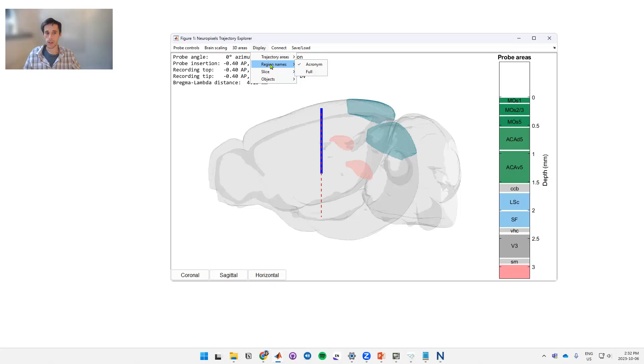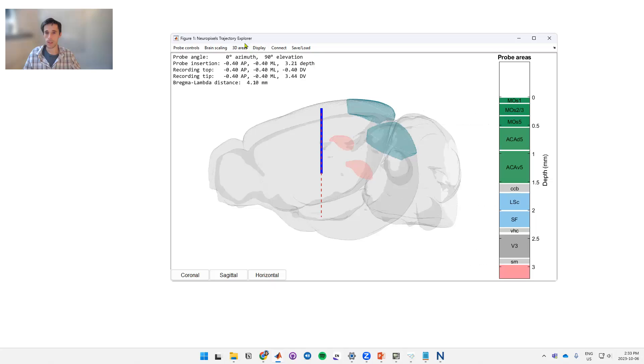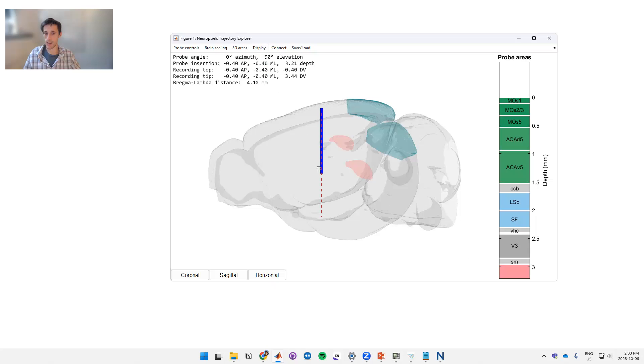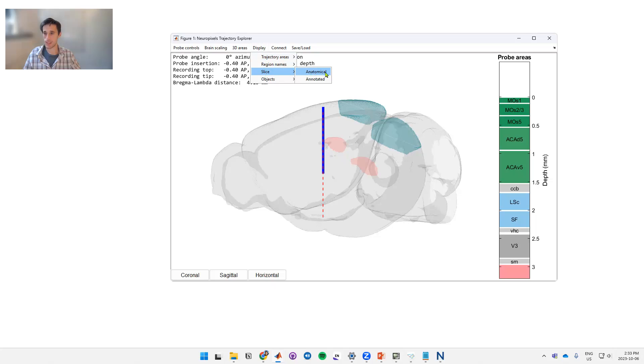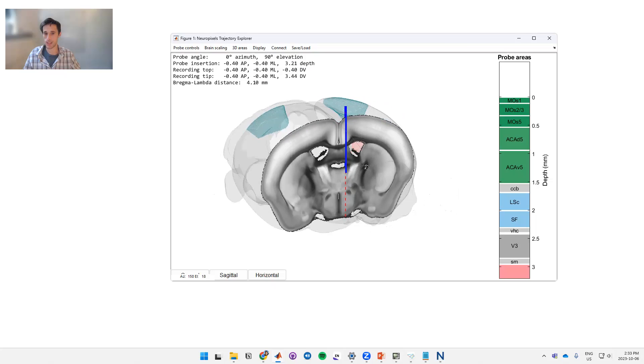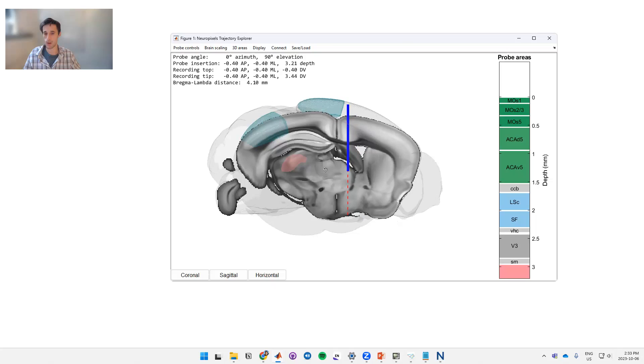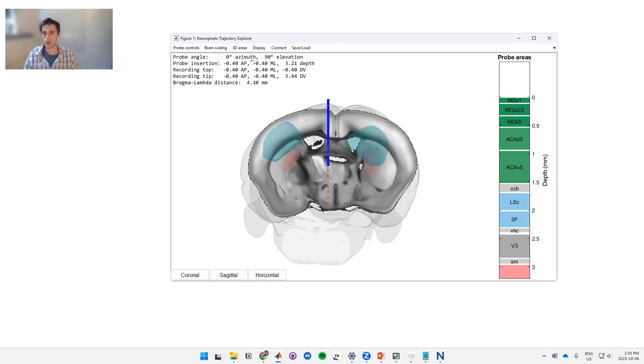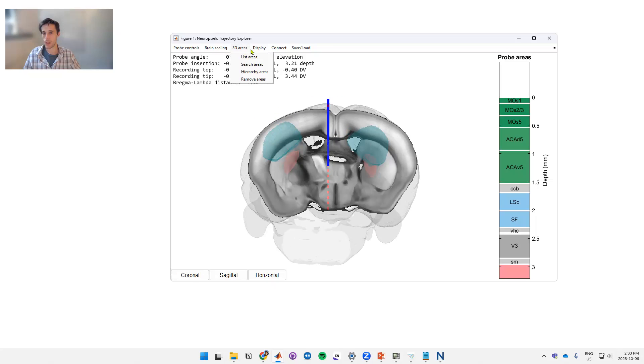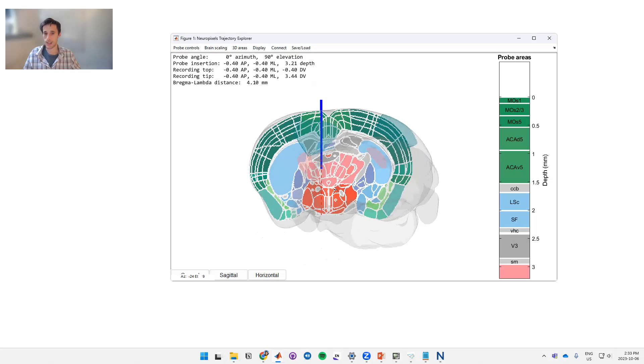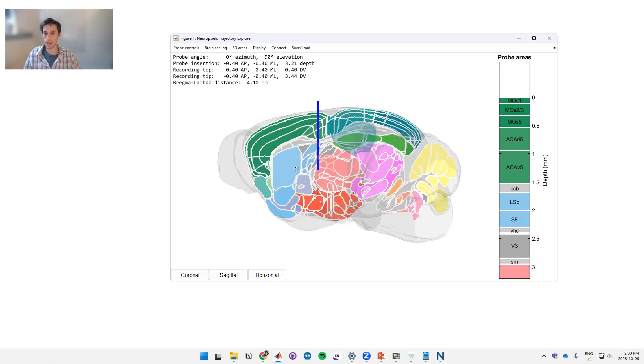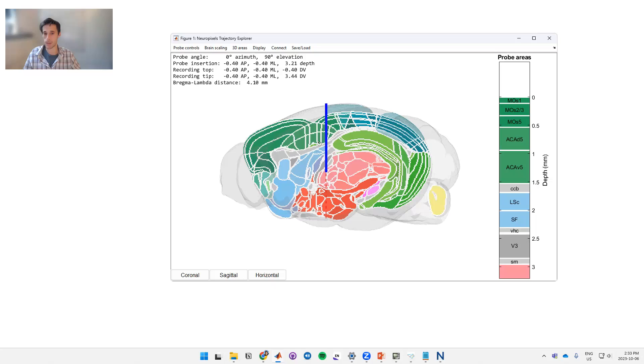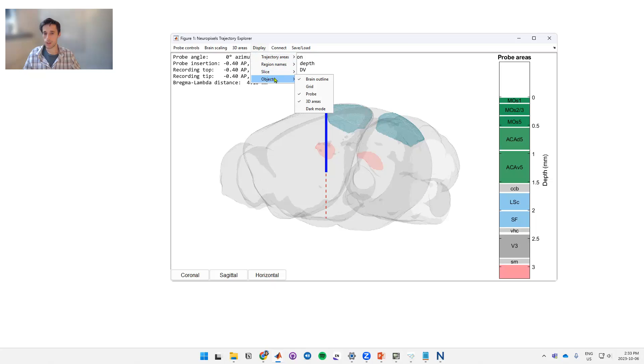We can also change the region names, so at the moment there are the acronyms. If you want to see the full name you can click on that and get the whole thing. We can also display a slice through the atlas along the axis of our probe. So if we display slice we have two choices. The anatomical which shows us the anatomical slice going through the probe. This changes with your perspective whenever you turn the brain. We can also see the annotated version. So this is not the anatomy but this is the parcellated anatomy.